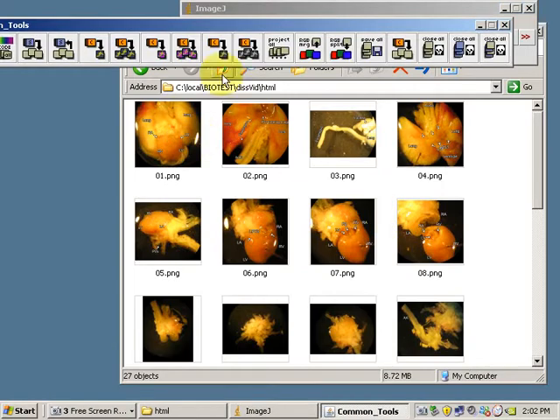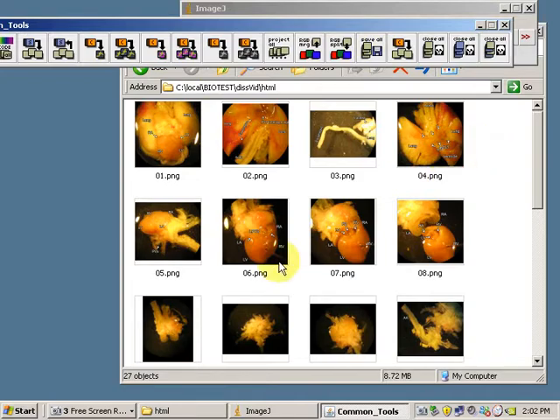There's a Save All button right here, but by default it's set to save everything as a TIFF file.